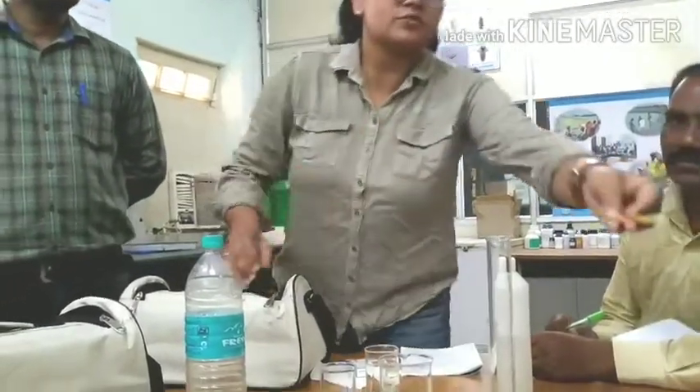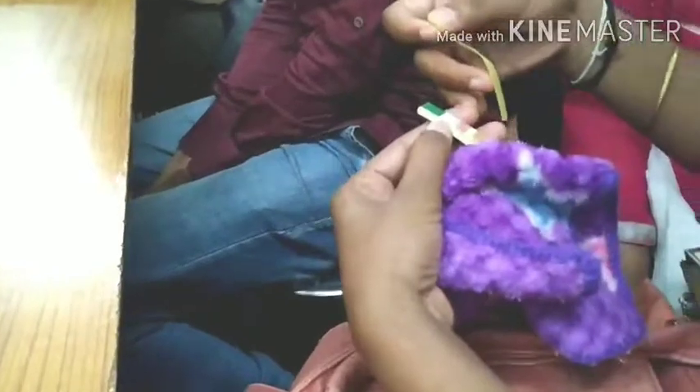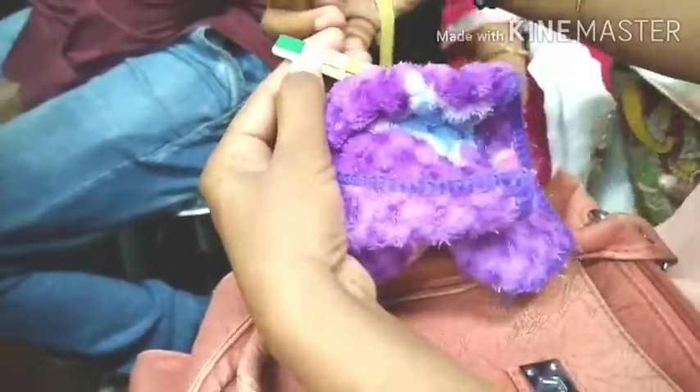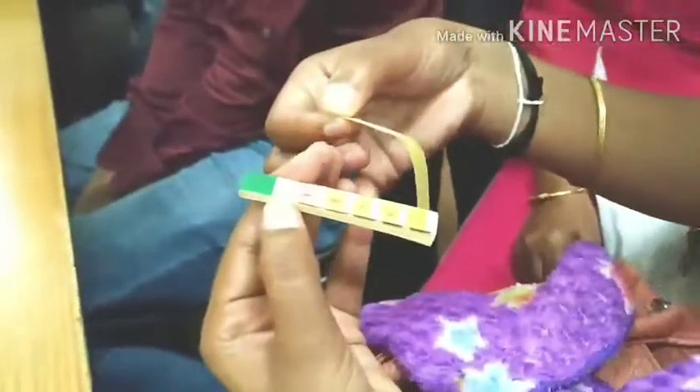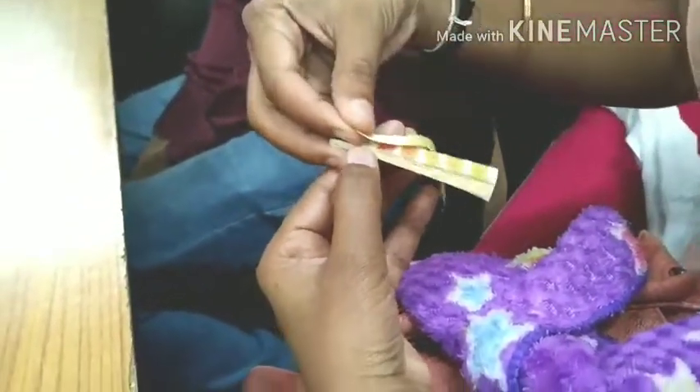You can take this along, sir. It's good. It's a pH paper and it's an indicator solution. I'm taking it — check it out, take the information.